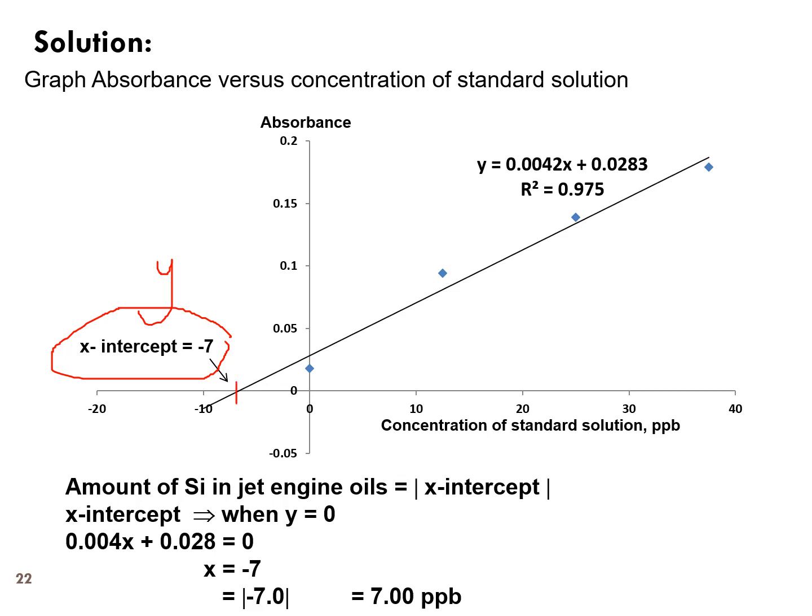So you cari kat sini, bila y 0, x-intercept dia dekat negatif 7 part per billion. So you akan dapat 7 part per billion lah. Yang ni kalau dia bagi x-axis dia adalah concentration of standard, you can directly get the concentration lah. Kalau macam yang contoh 1 tadi, kat sini volume of standard.